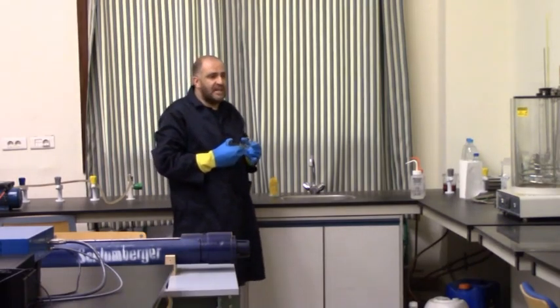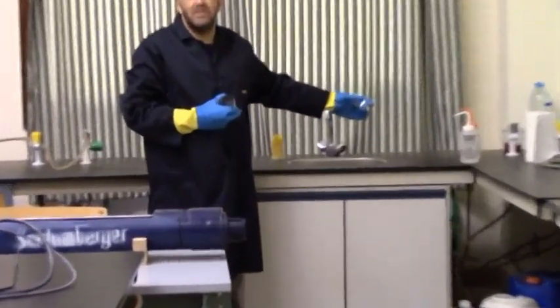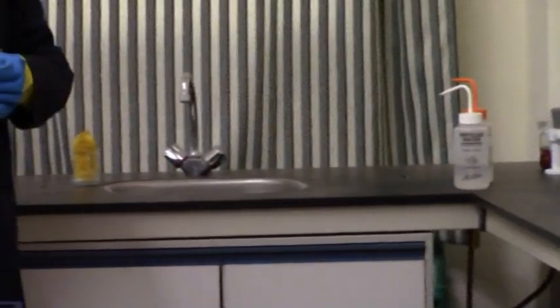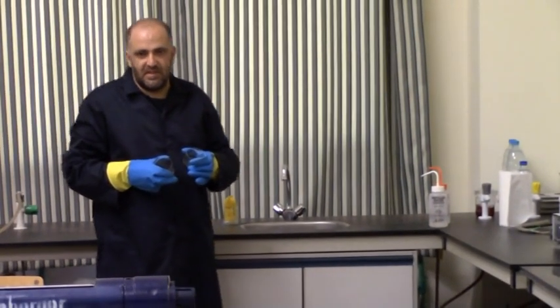So let me first clean it with this soapy water, then I rinse it with distilled water, followed by alcohol, and then finally distilled water again, and then I use a tissue to dry it up before I put in the sample. So let's get to work.